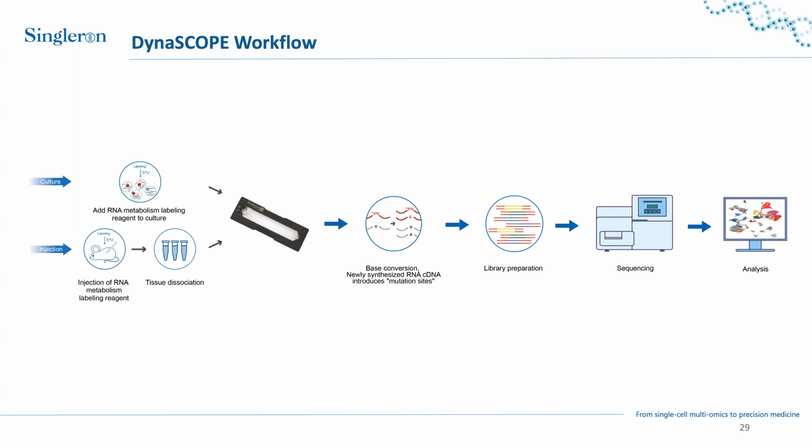But this effect on viability, of course, also really depends on your tissue sample. Some tissues might be affected more than others. So what we usually recommend is that during the experiment, you would regularly check the cell viability to ensure that you don't lose too much viability.